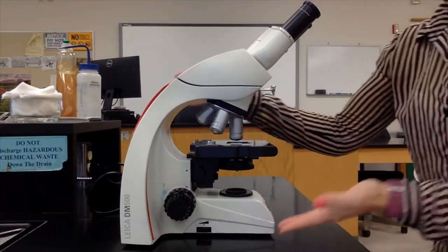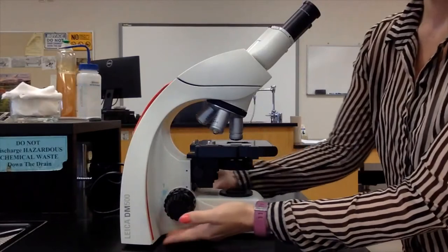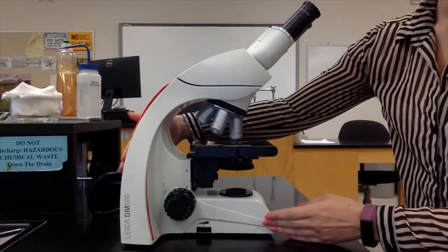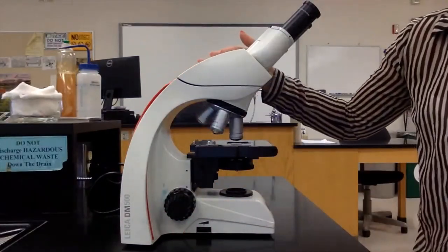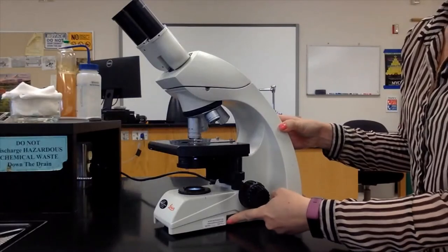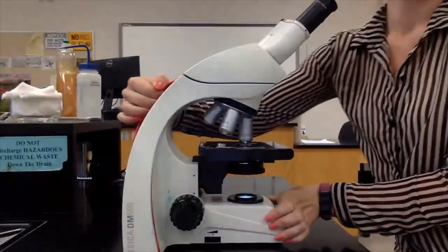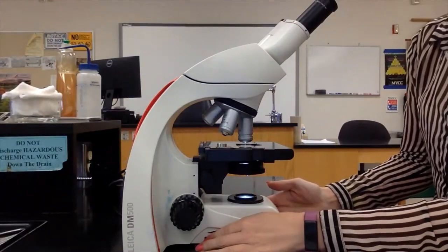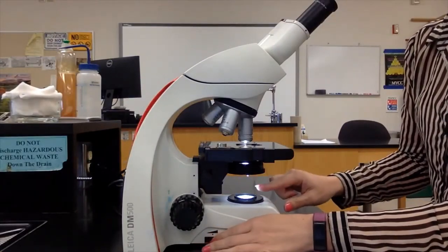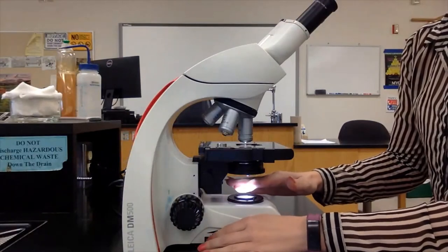As for the parts of this microscope, it also has a base and an arm here. You can see a light switch here and this turn dial is called the rheostat. It controls the amount of light that shines onto your specimen.